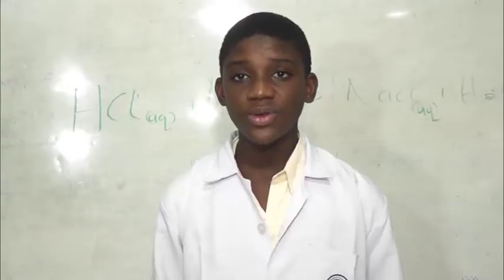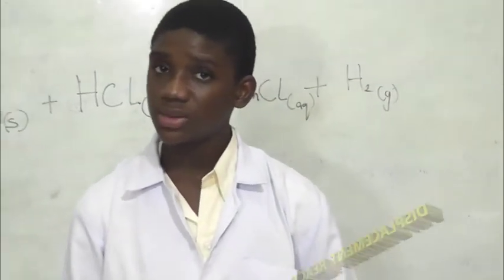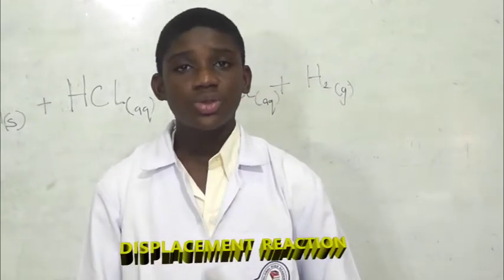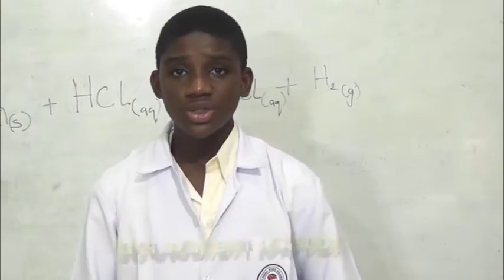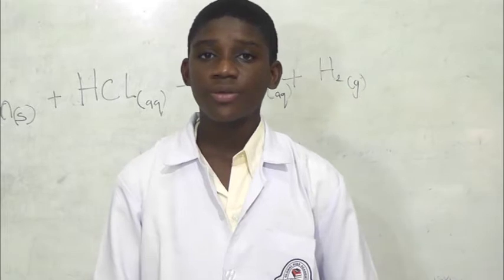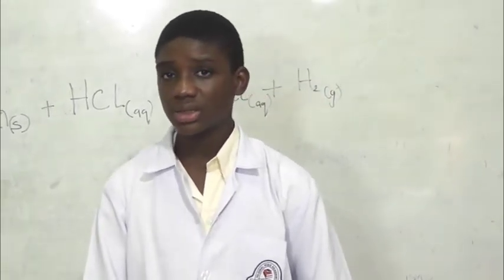Once again, I am here to demonstrate the wonderful chemical properties of acid, which include displacement reaction. Please don't try the displacement reaction at home. So I would like to tell you more about displacement reaction. Displacement reaction is a kind of reaction whereby part of the reactant is replaced by another reactant.